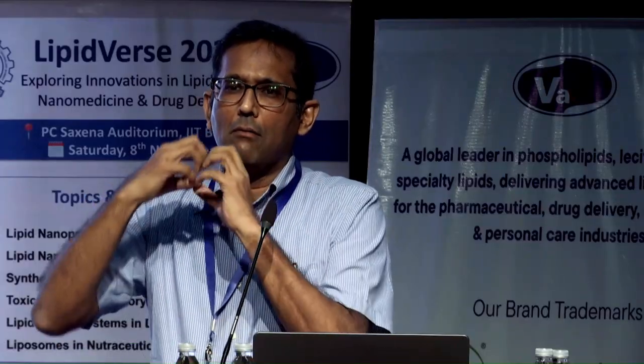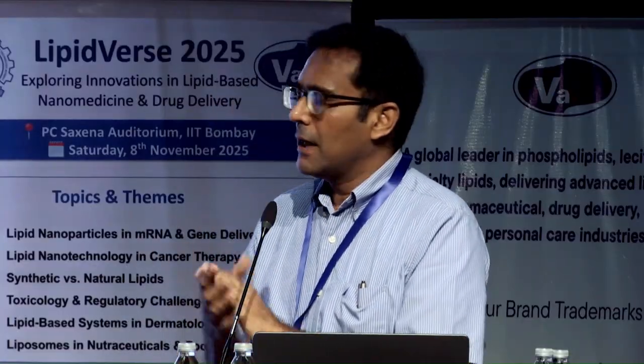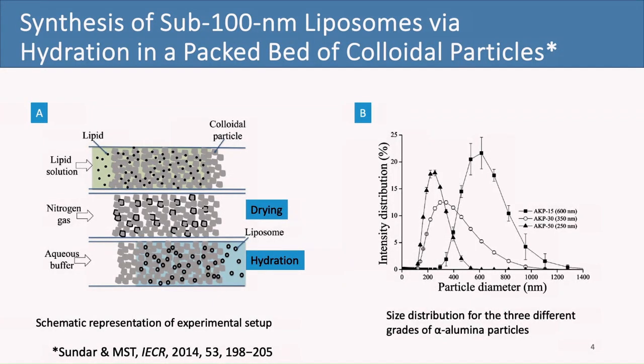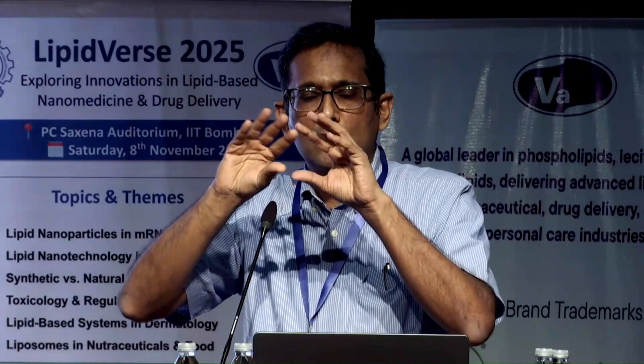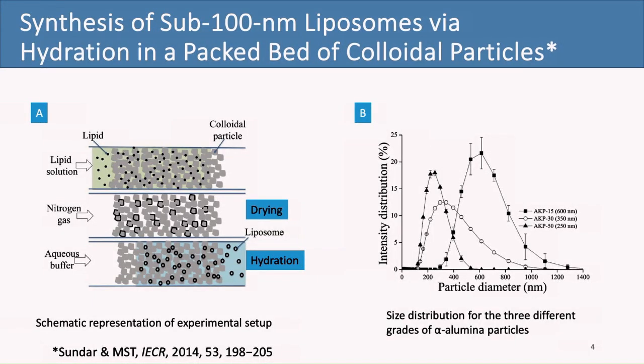Not completely deform, but they sinter and they're very well lodged inside the tube. And then we sent a lipid solution through it. And then we had a nitrogen gas pushed through the same thing. The lipid solution is a solvent with the lipid. And so when you pass the nitrogen gas through that, the solvent evaporates. And we believe that we will have these lipid particles coating the surface. And then we send an aqueous buffer which may or may not contain the drug. And then we see what comes out on the other side.